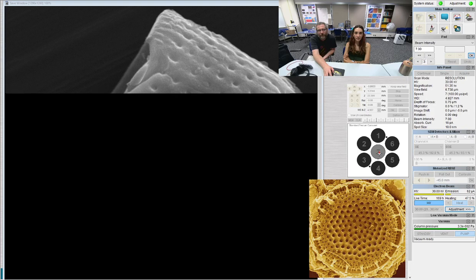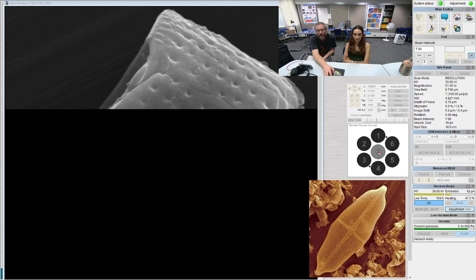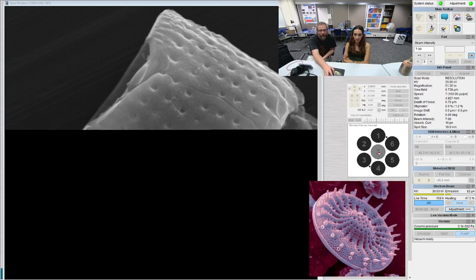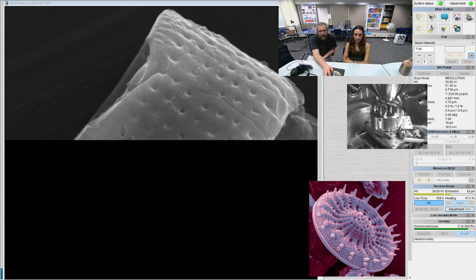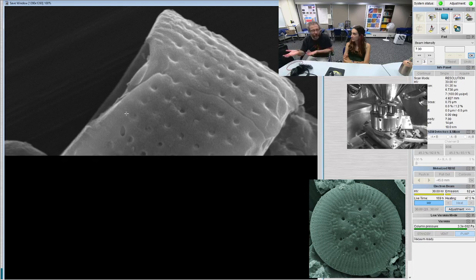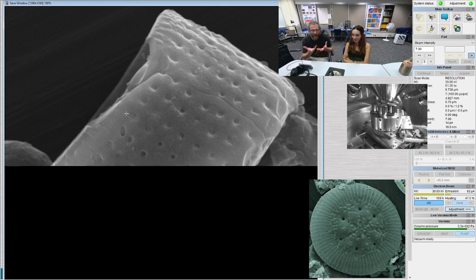There's a stage controller, and it actually records X, Y, and Z right here. Also the rotation, the tilt, and the working distance, how far. And all those things are captured as metadata and included in a text file that goes along with the image. So we don't really need to do anything to record that information. It's already done. The only problem with that is that if I take the samples out of the stub holder and move them into a different stub holder, then the X, Y, and Z positions will all change. So it only works as long as I keep them in the carousel.